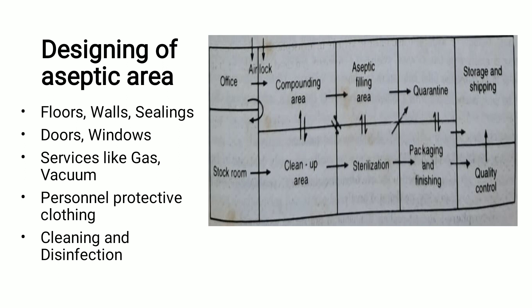Regarding floors, walls, and ceilings in the aseptic area: these are specially designed surfaces coated with antimicrobial paint. Although they are constructed similarly to normal floors, walls, and ceilings, a special antimicrobial coating is applied to those surfaces to ensure no microbial contamination can occur.